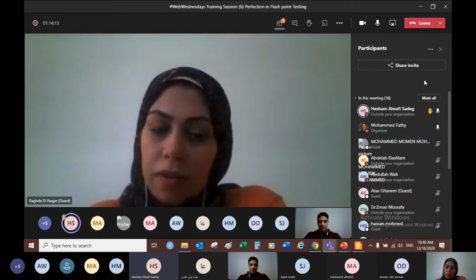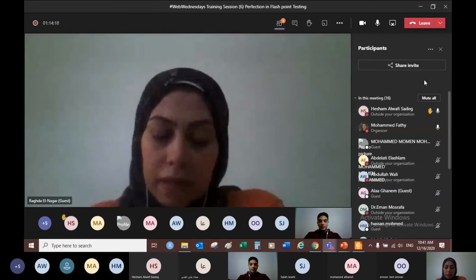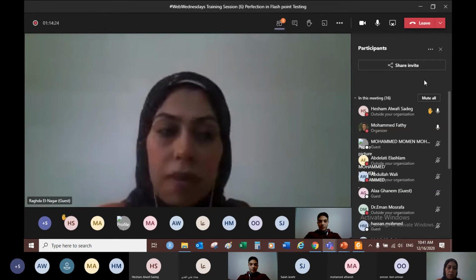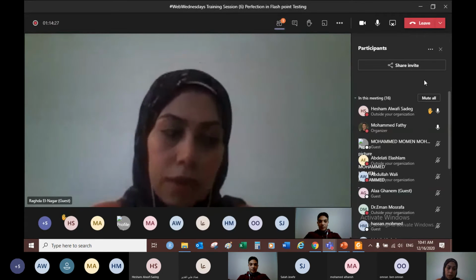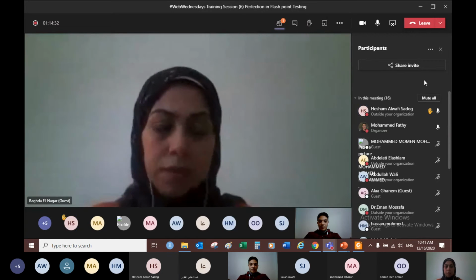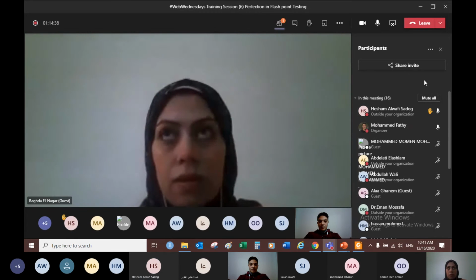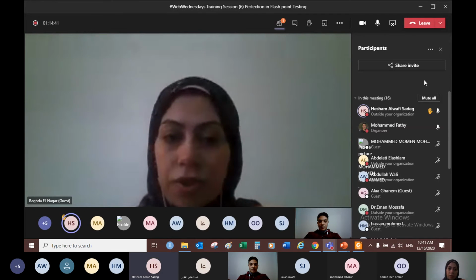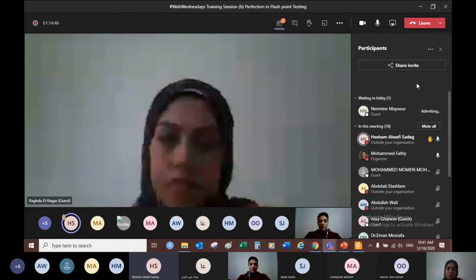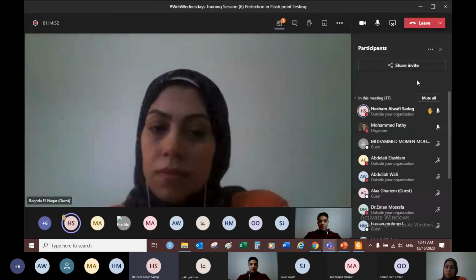For isopropanol, can we use it? Isopropanol, the ethylene glycol is more range. And we may make a mixture with ethylene glycol and water. It's the preferred. Isopropanol may cause corrosion, may cause disturbance in the circulating system, but ethylene glycol is safe. In case we have isopropanol, does it affect the instrument or not?